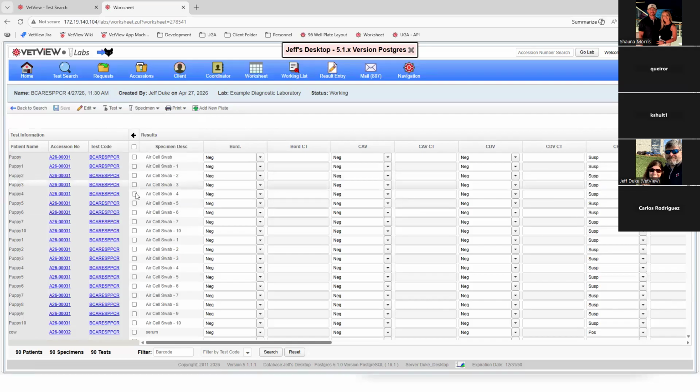So that's very useful when you're doing big, large cases, especially like PCRs or FAs, SNs, things like that, where you're typically running on interfaces too. And I will touch specifically on plates in the next section, and some of the other options here, but generally just trying to focus on navigation right now.